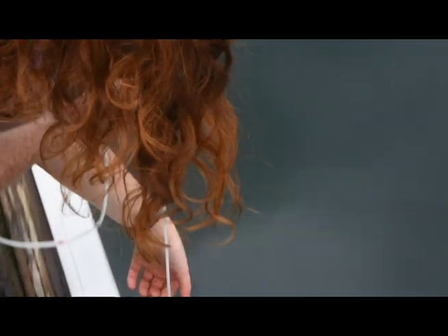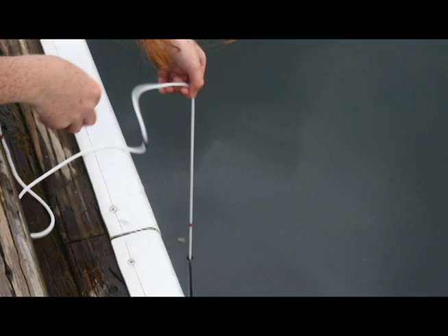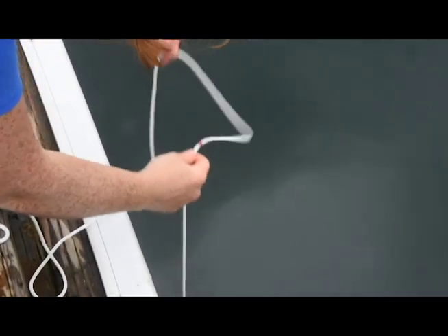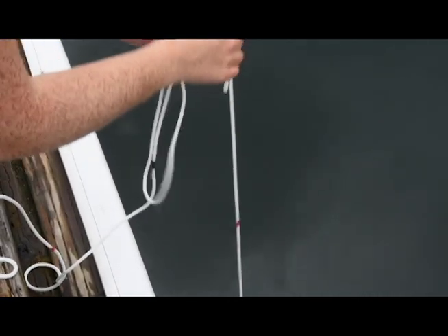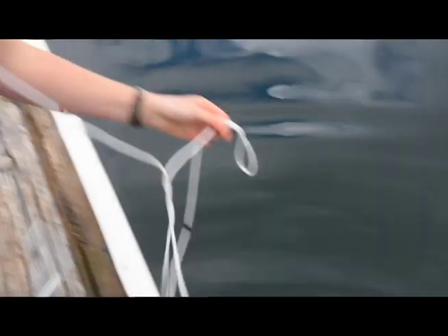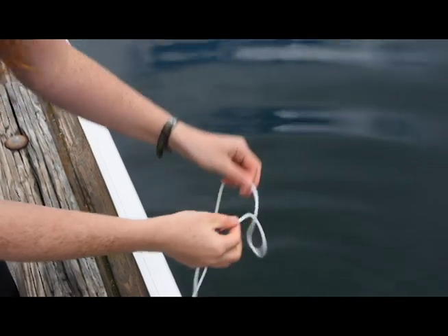Next, slowly raise the disk until it just becomes visible once again. Record this depth as your second turbidity reading. Average these two depths to get your final turbidity reading.